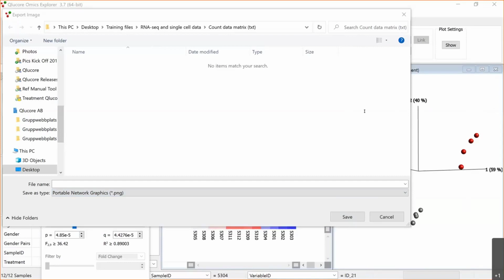Okay, here. After importing the BAM file, is it possible to analyze abnormal splicing events, allele balance alterations? Well, in the NGS module, you can visualize the different gene splicings as well.